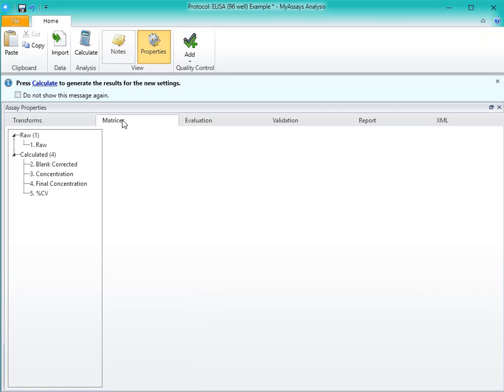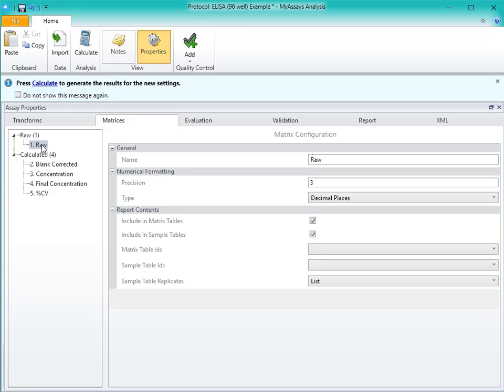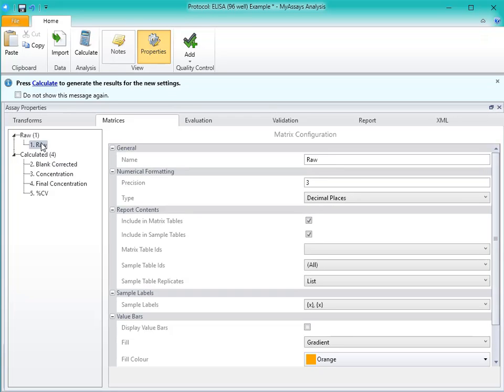The Matrices tab will show the various raw and calculated matrices in a tree format in the pane on the left-hand side of the screen. By selecting these matrices, you can change the associated settings. Remember that matrices are containers that hold specific types of data. The raw matrix is the data that is imported into the protocol from your reader, and the calculated matrices are the results of the various transforms.